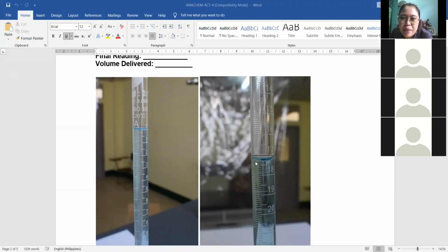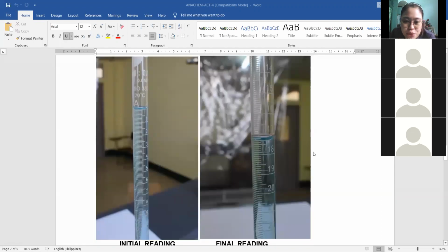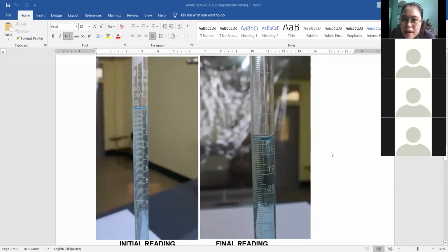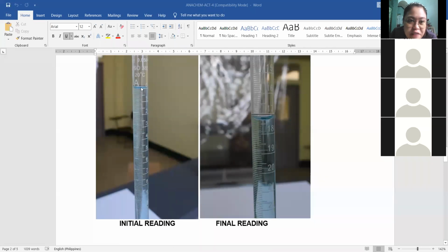This is an actual experiment na ginawa namin sa school. Hindi kami nakapag-video totally kasi medyo mahirap. Like, kung ako mag-solo flight ng video sa school, mahirapan ako mag-video at the same time ako yung nagkakandak ng experiment. So, ito na lang muna yung picture. We used a blue solution para mas madali niyong makita. And after washing na ito, nag-fill in kami ng liquid sa loob after washing. And kung nakita ninyo, this is a clear solution, though may color siya, pero clear solution siya.